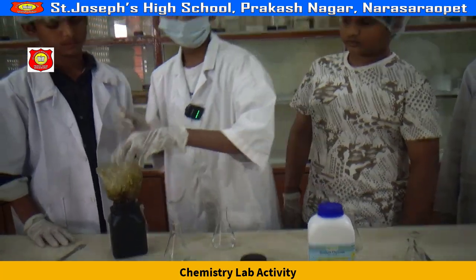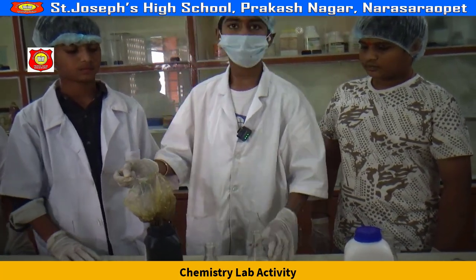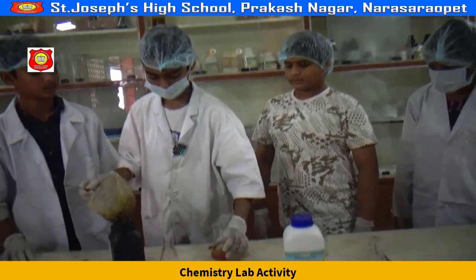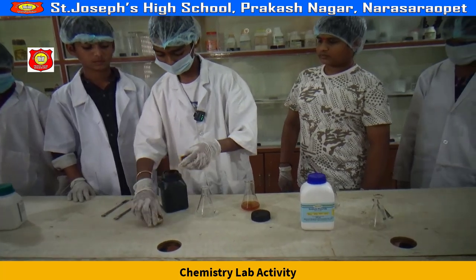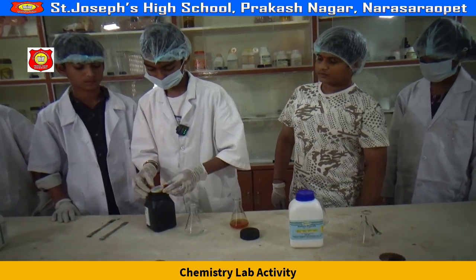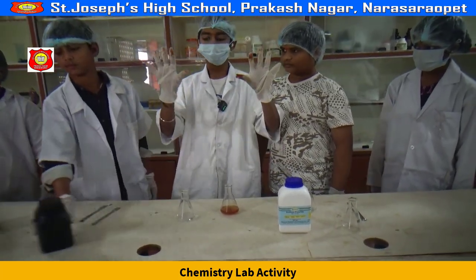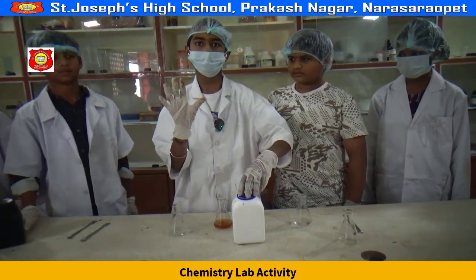As we can see, these are very highly reactive, so we need to wear protective gear like mask, gloves and hair wraps. Now we can see the color. So we are going to keep the spatula aside. As you can see, these gloves protect me from the ferric chloride anhydrous that is very reactive to our skin.